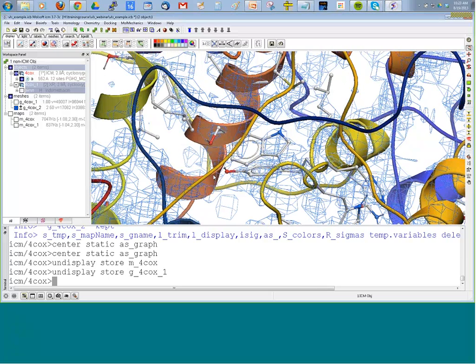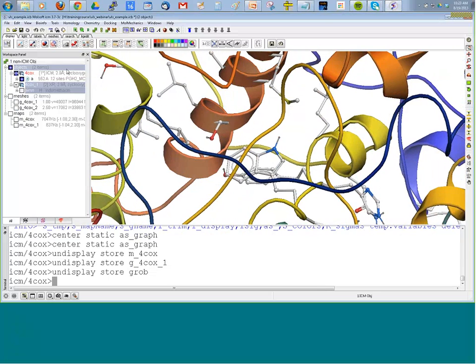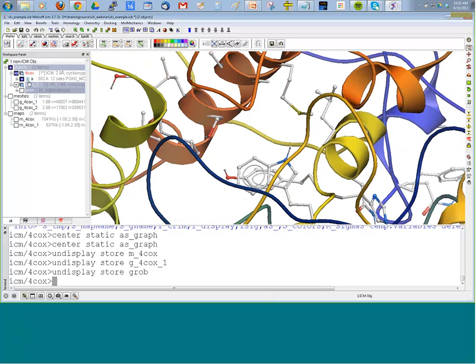And we had another question regarding an ion in the pocket. If there is an ion in the pocket, you need to make sure that when you set up the receptor, the ion is listed in the selection. I can show that in a minute. So you would have two molecules here: the receptor and then the Het atom below this in your object.